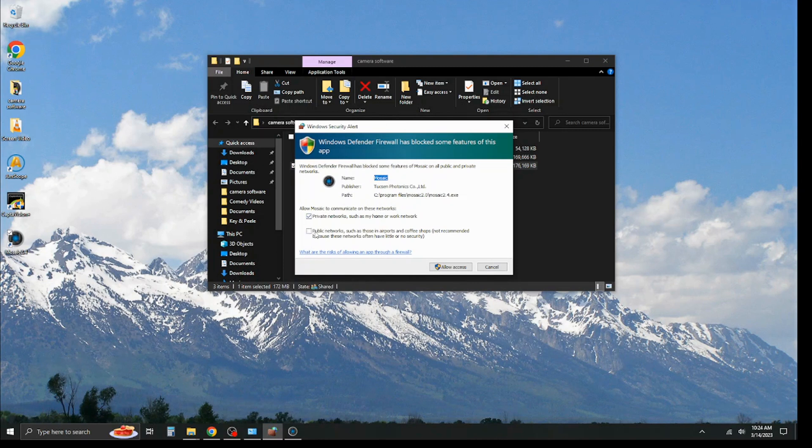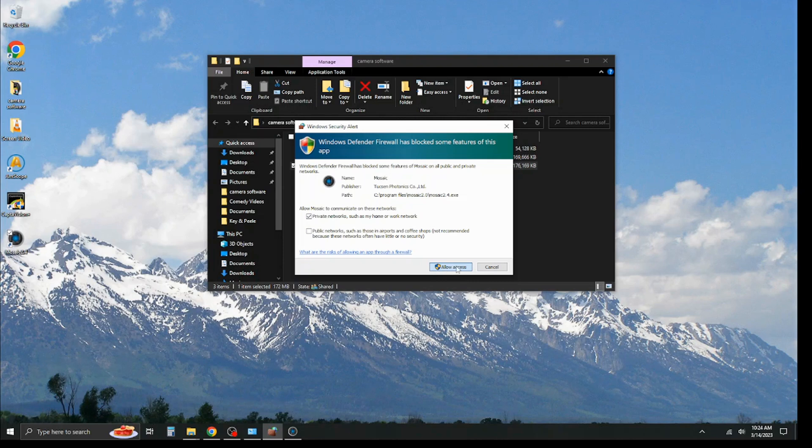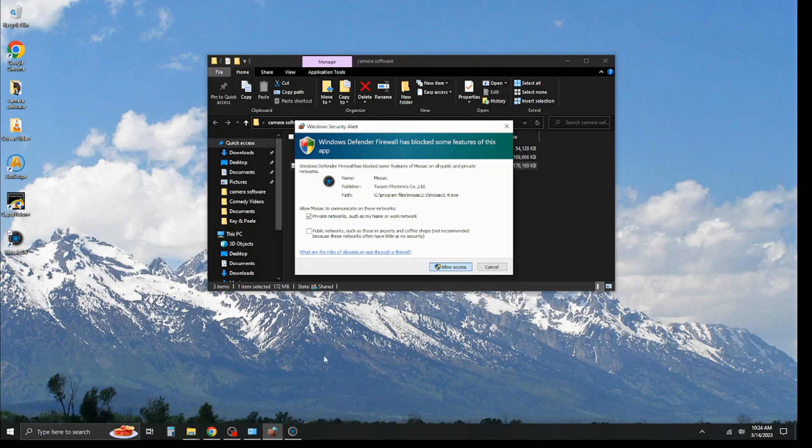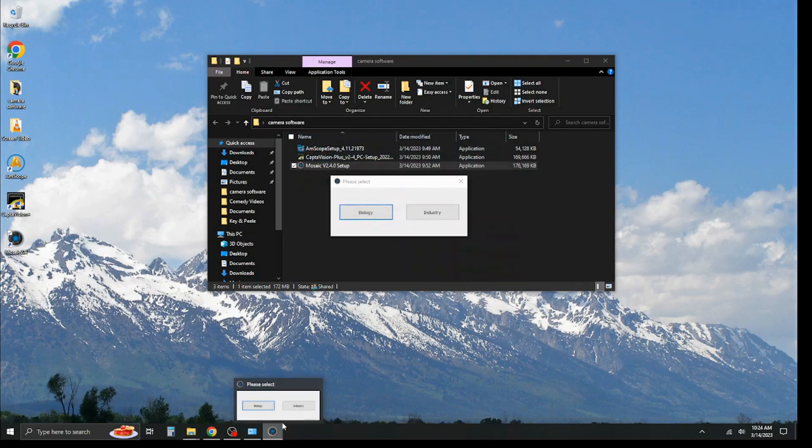You can allow access on public and private network, however you feel. We're going to go ahead and allow access again because we've used this before, vetted it, and it's perfectly fine software. Click here. Seems to have frozen up for just a sec. Probably because it's in the install process. Okay, and that's finished up.